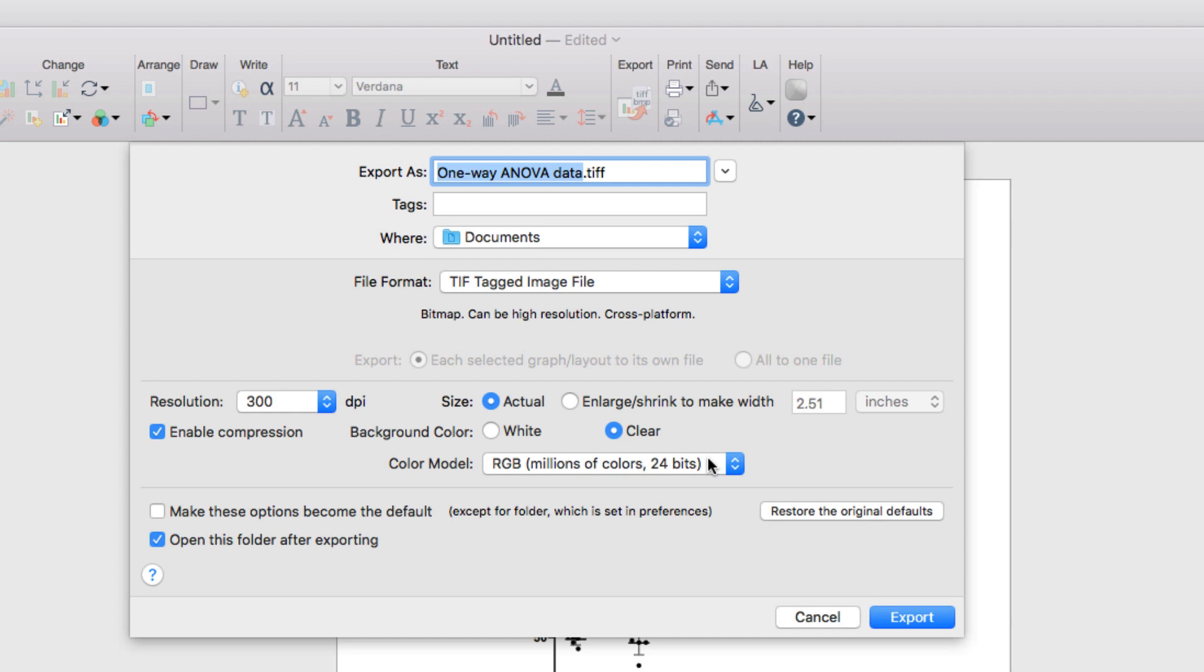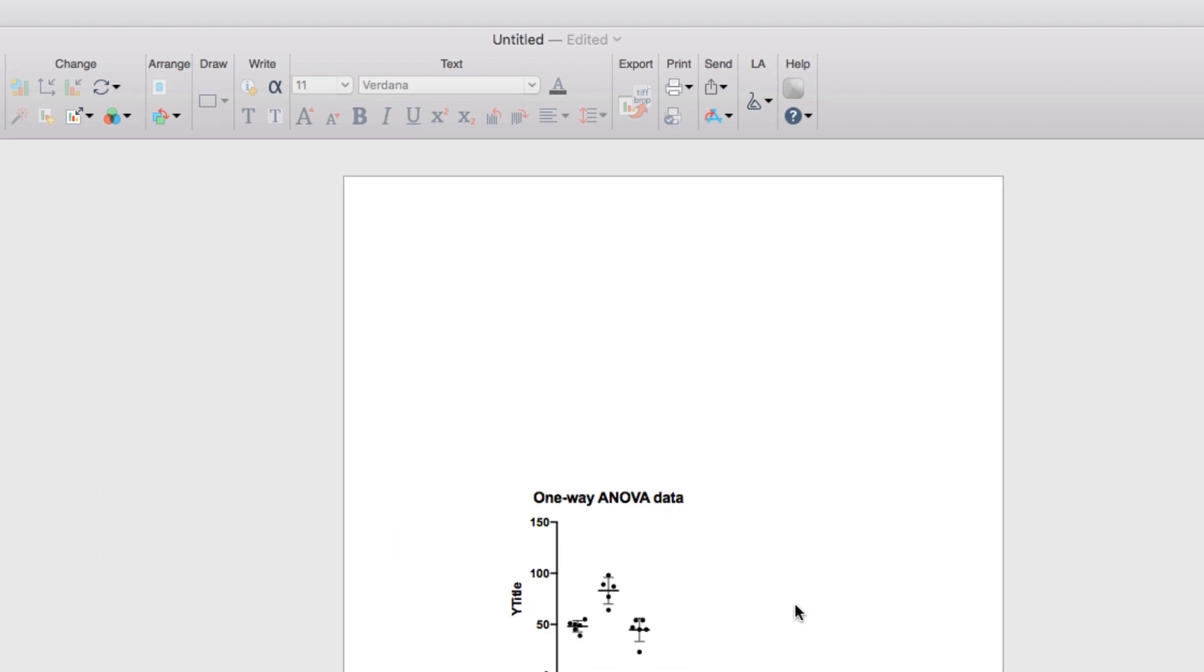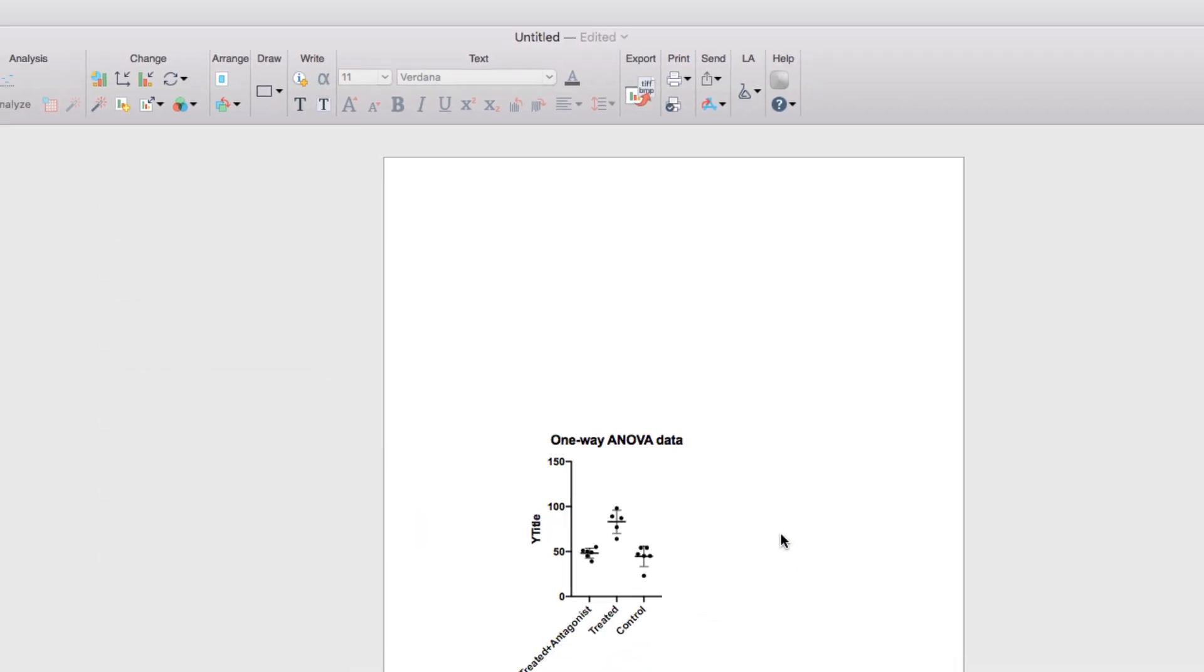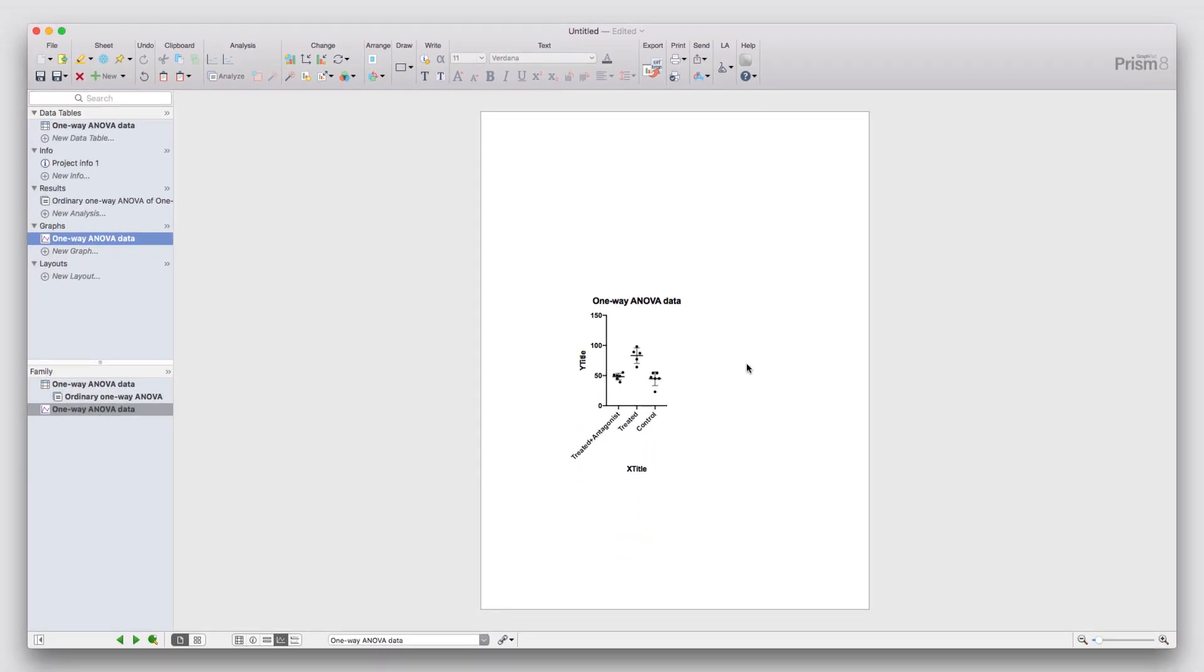So that's it! Those are some of the fundamental aspects of Prism that you can use to start working with your own experimental data. There are tons of other types of analyses, graphs, and features throughout Prism, and one of the best ways to explore those is through the use of the tutorial data sets. However, the basics always stay the same as you go from data, to analysis, to results, to generating and customizing your own graphs.